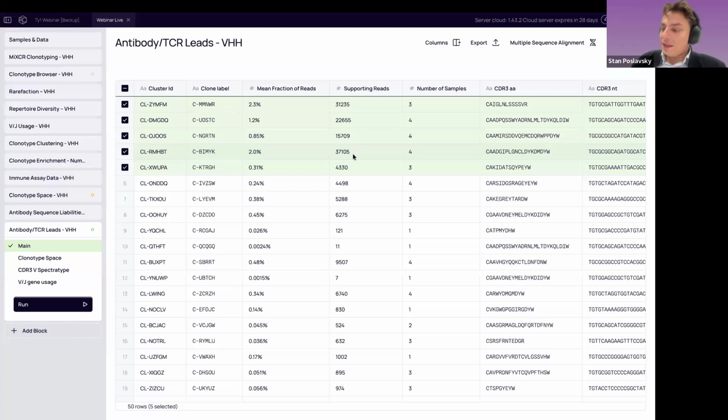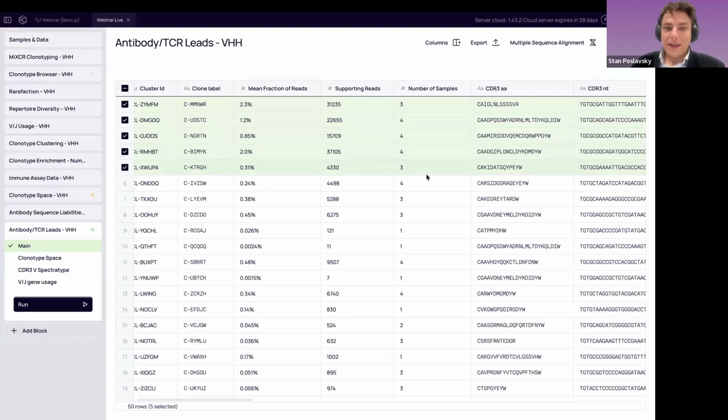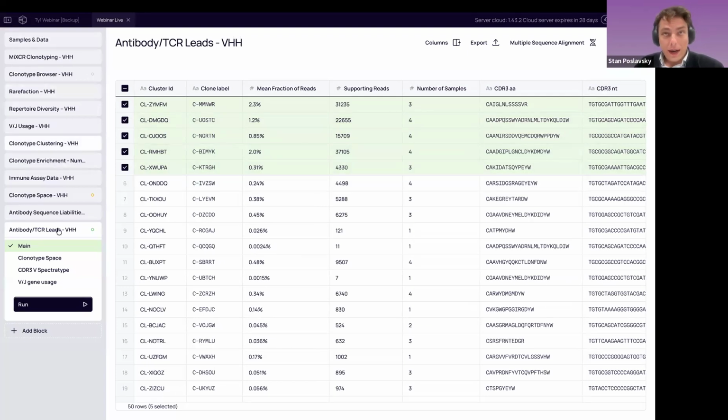But this gives a pretty straightforward idea of how we can streamline the whole pipeline, make this an automation, and with this, let's launch the third poll of our webinar.